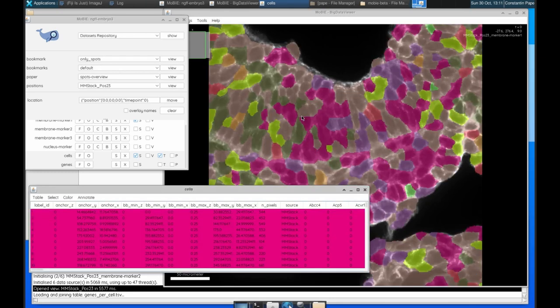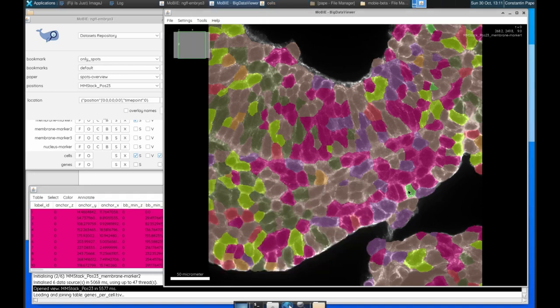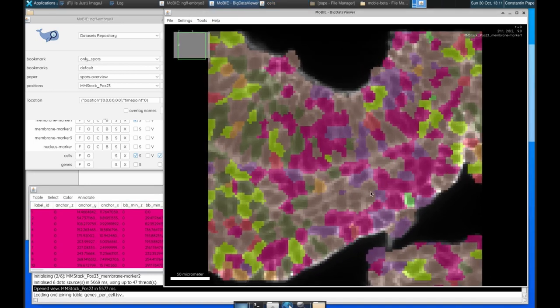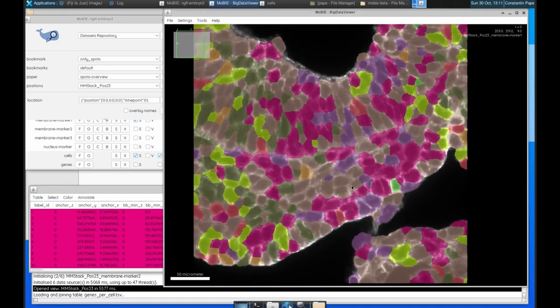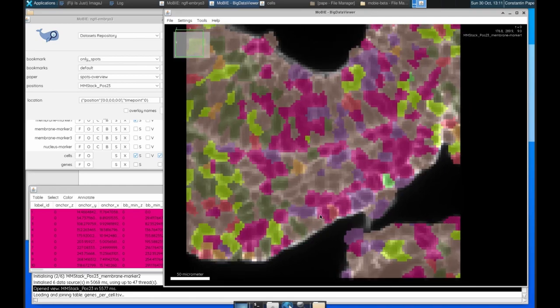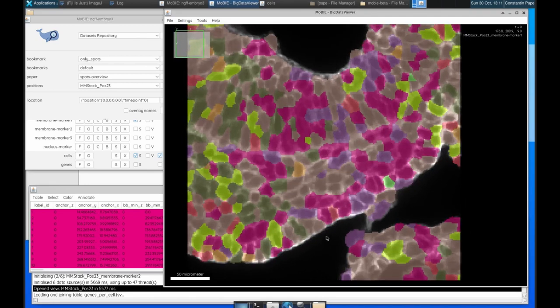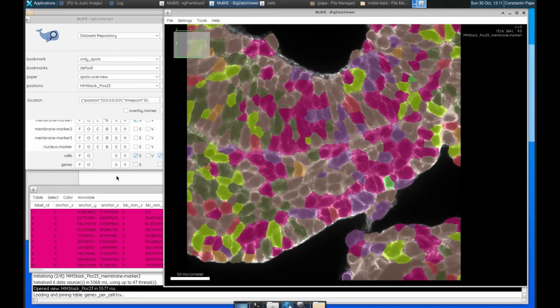And now we have our cells but colored by our gene clusters. So each cluster has a different color. And we can see that in its spatial context, browse around, do everything we would normally do with Mobi here.